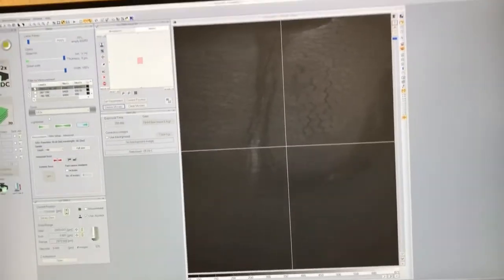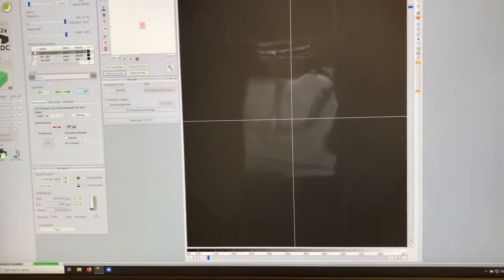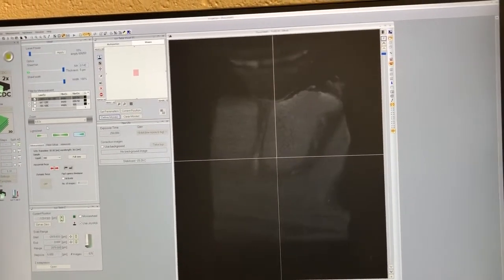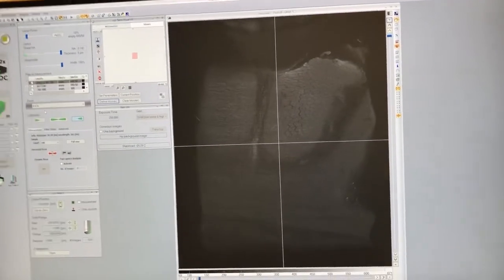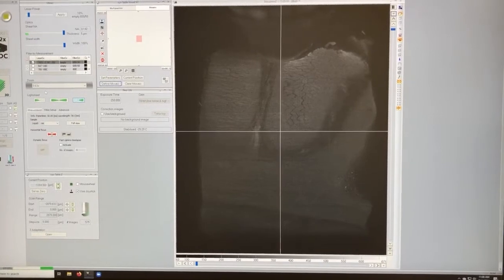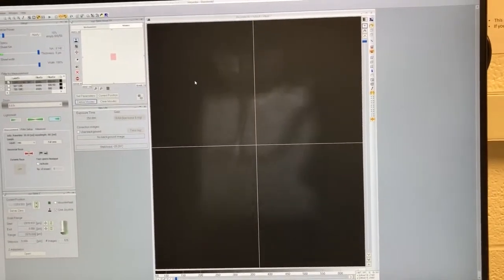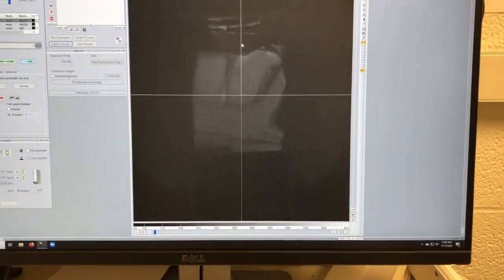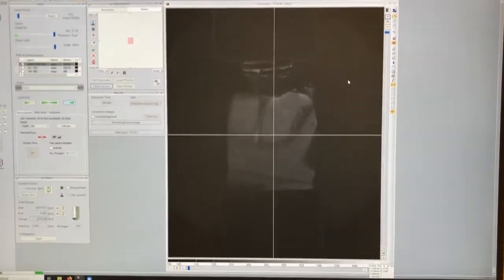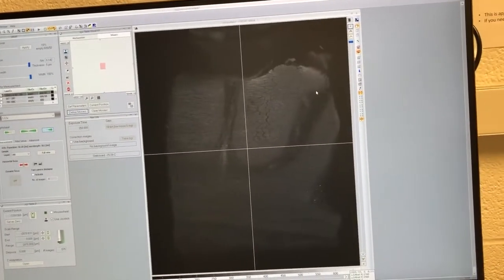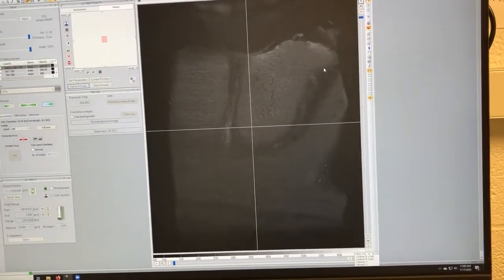A useful rule of thumb: if you have a sample like this, you can zoom in to the point where the sample is still visible in its entirety in the field of view — and that won't cost you any time. It will cost you more data if you don't crop, so you'll be storing information all over the frame as opposed to just the sample area, which you could crop to save disk space. But disk space is cheap, so having the sample fill the frame means you're getting all that detail for free.